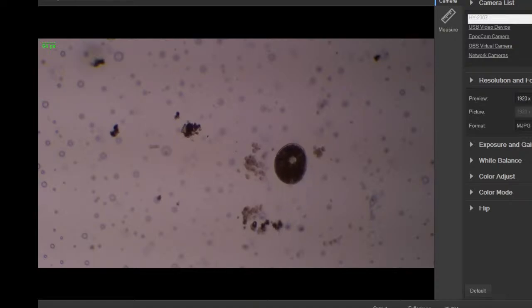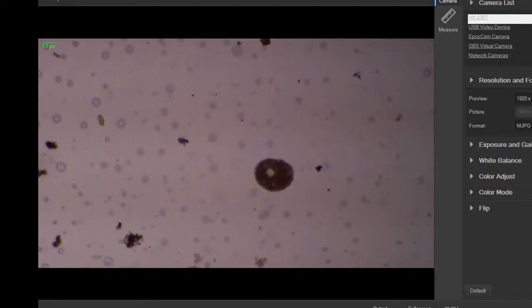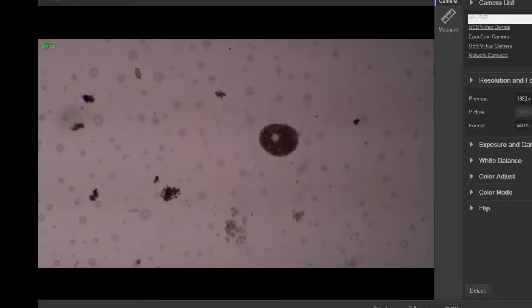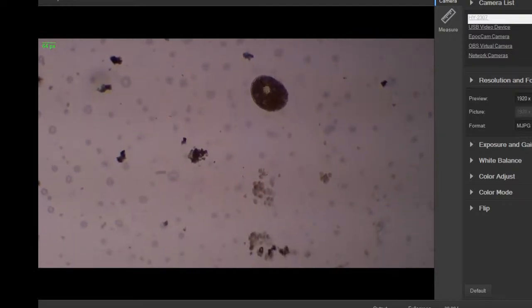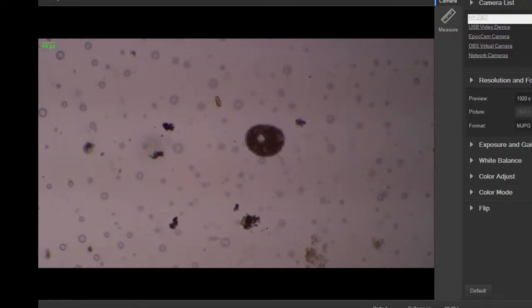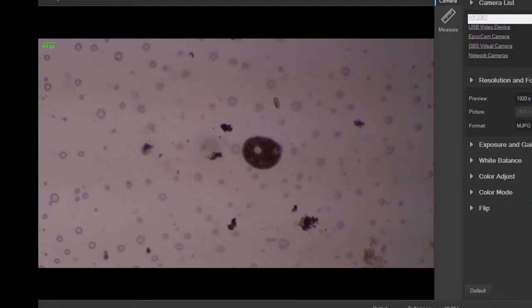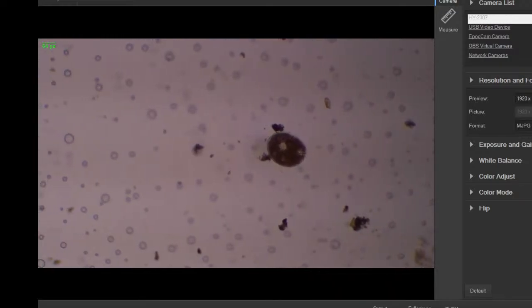Let me fix this light on this guy. Yeah, looks like it's a Volvox, or something very similar to it. Like there's another called Gonidium. This is basically a colonial algae. Basically a bunch of things get together, form a ball of cells. You can see the ball structure there. And kind of like a Death Star, but made of balls instead of metal plates.